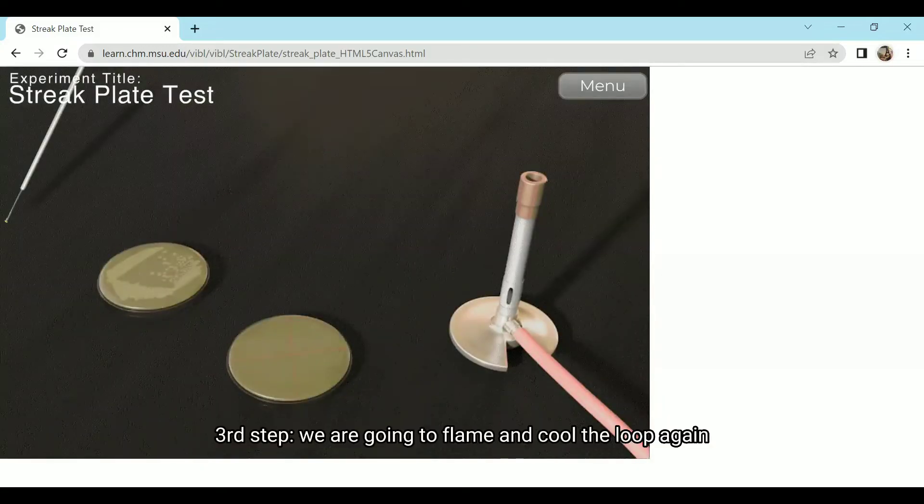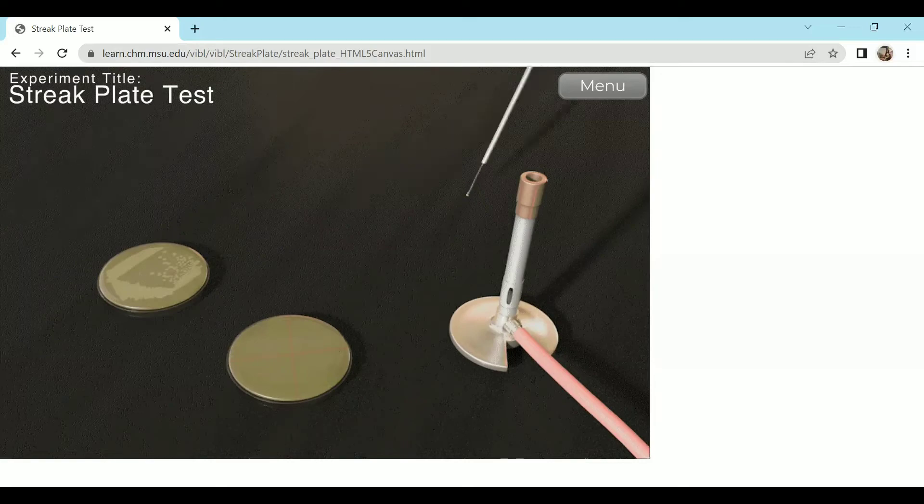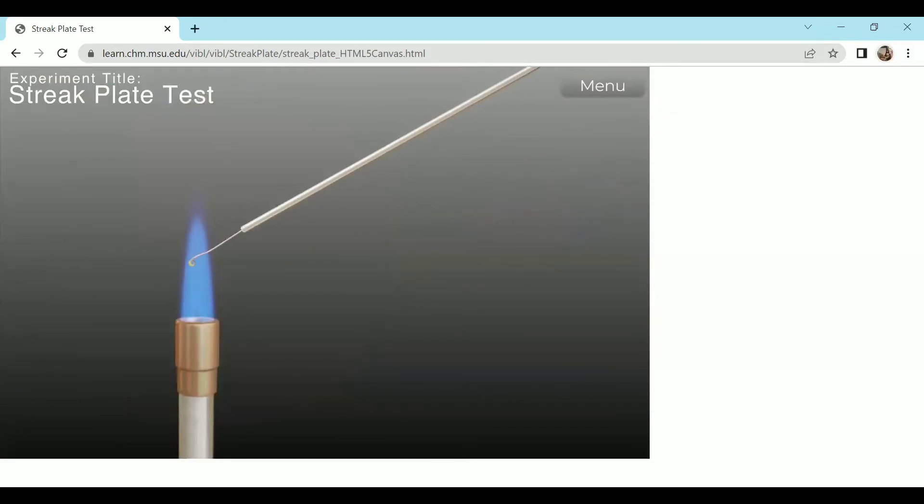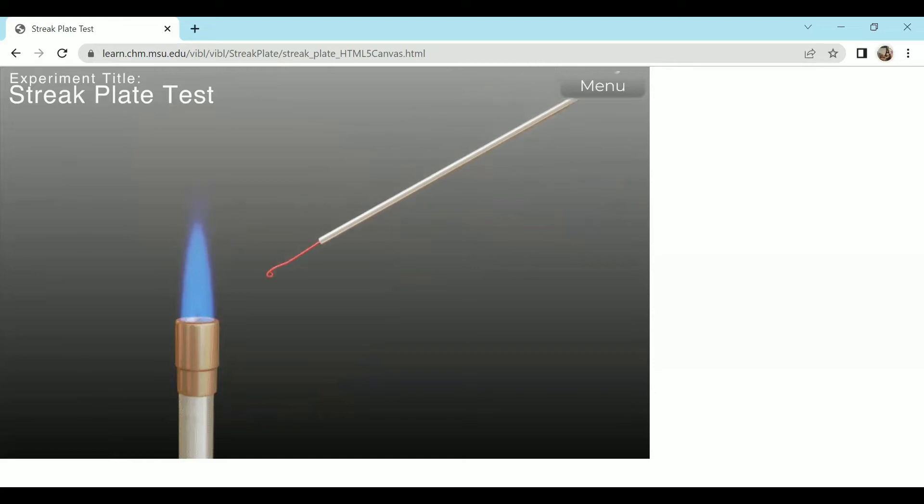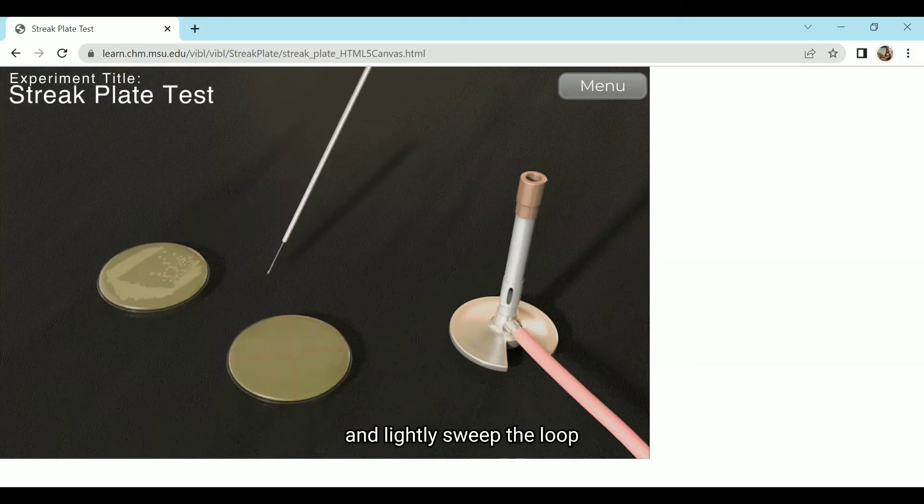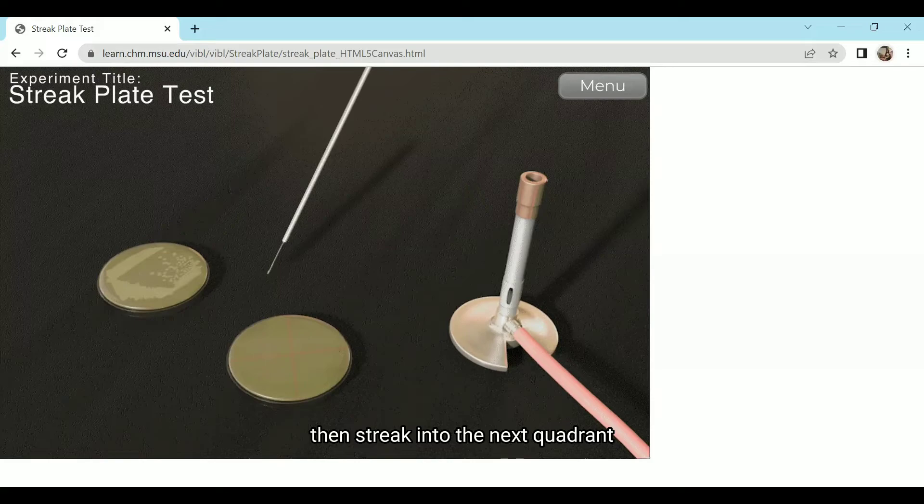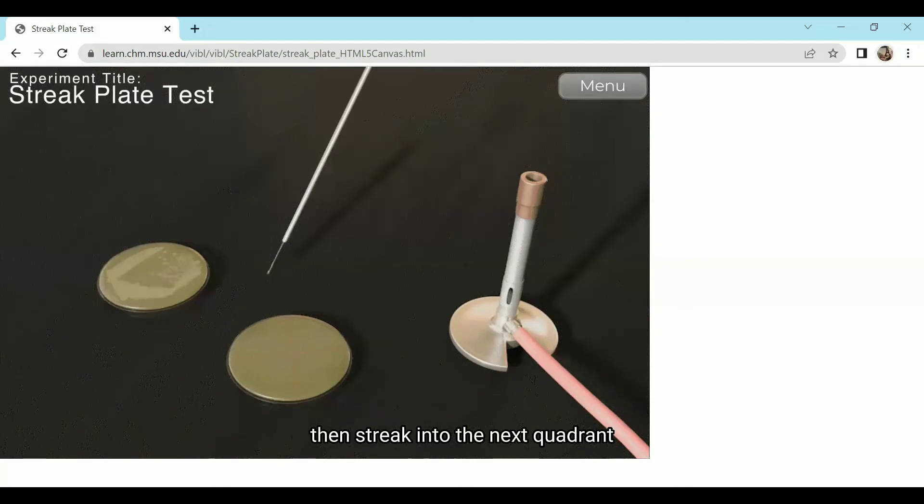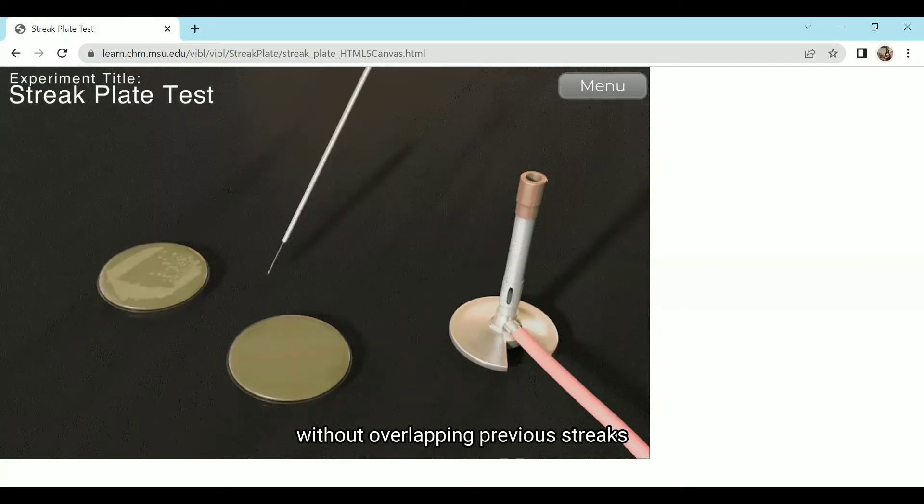Third step, we are going to flame and cool the loop again. Fourth step, we will turn the plate 90 degrees and lightly sweep the loop one to two times through the inoculated area, then streak into the next quadrant without overlapping previous streaks.